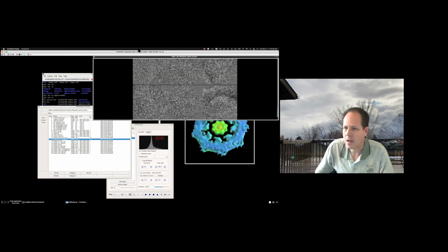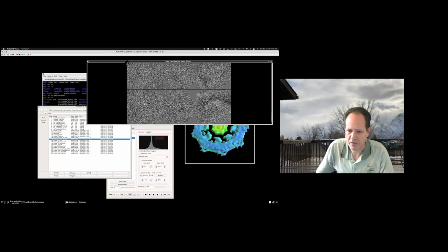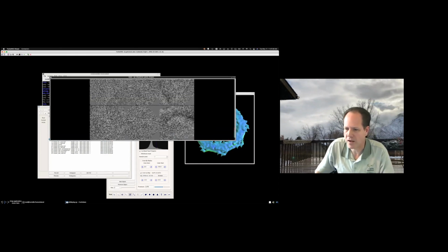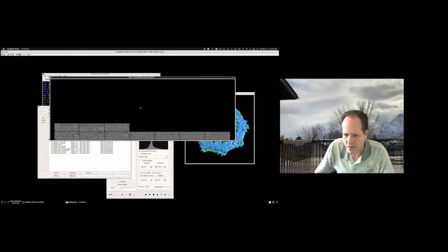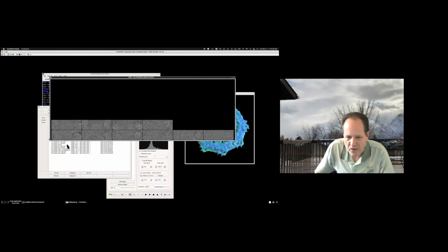Almost, there we go. These are pretty big volumes, right? So these are 320 cube volumes, so it takes a little time to generate them. And what we're seeing is XYZ slices altogether. I think I left that at like 1 or something, so it's actually pretty hard to see anything here.